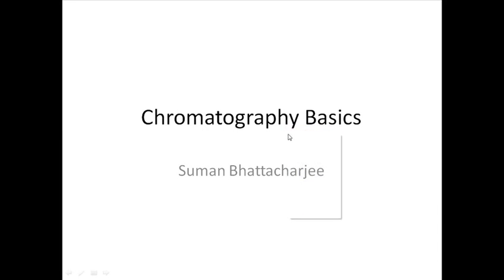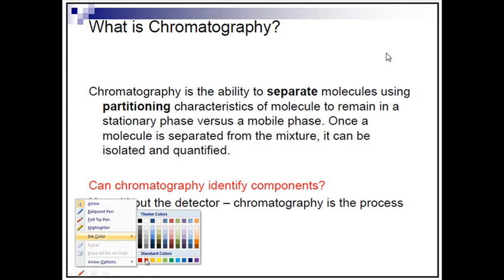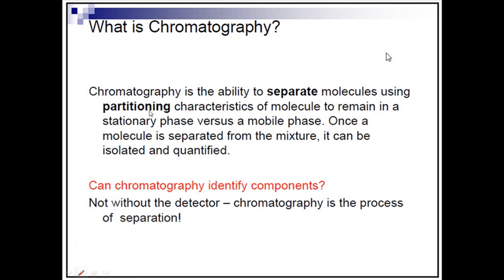So let's move on. What is chromatography? Chromatography is the ability to separate molecules using partitioning. So what do we mean by partitioning? Let me take a color for explaining. Partitioning means, in this case, the partitioning characteristics of a molecule to remain in a stationary phase versus a mobile phase.